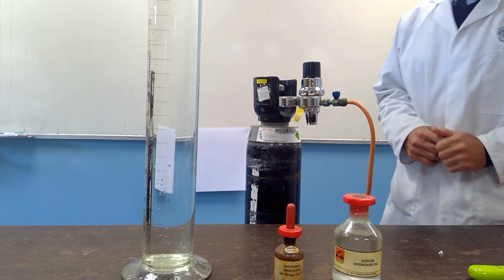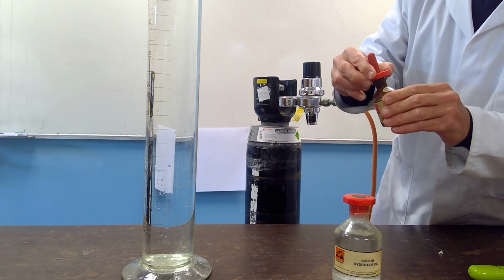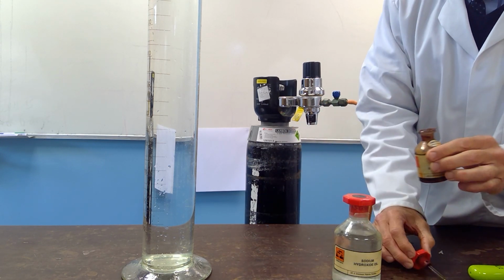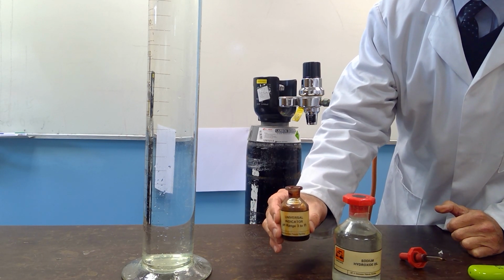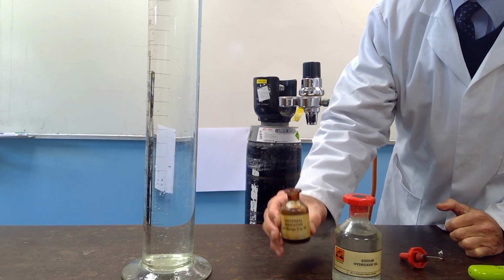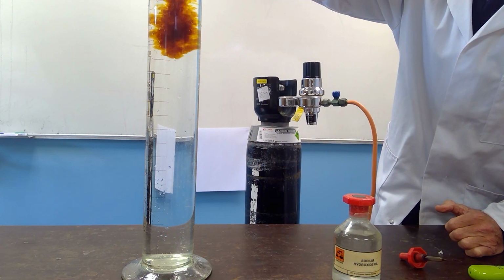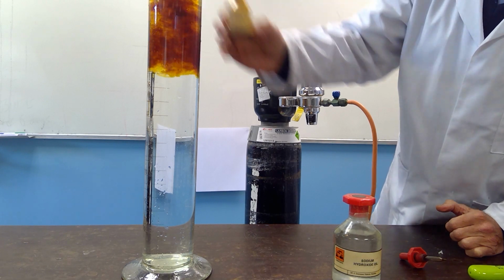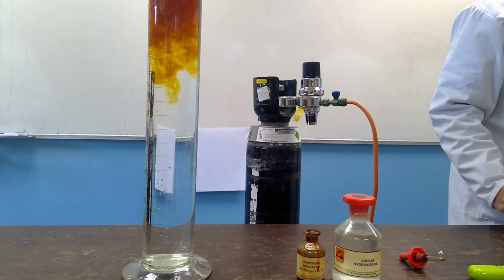To illustrate this, we will bubble some carbon dioxide into water. However, before we do that, we will add a little bit of universal indicator, which will tell us the approximate pH of the solution. So that when we first pour the indicator in, it is already slightly acidic.